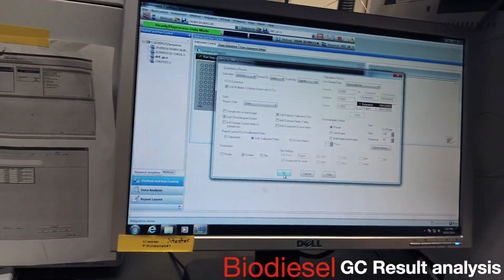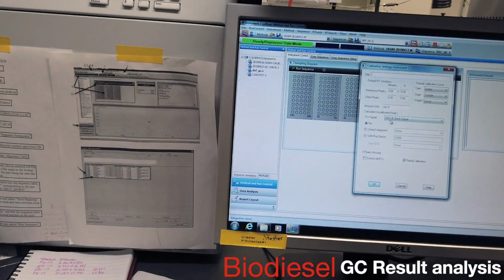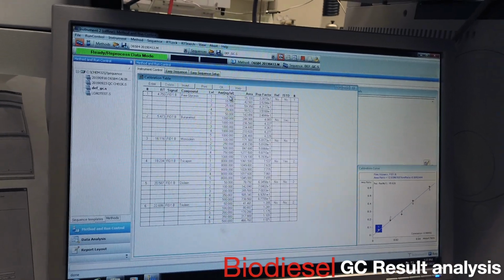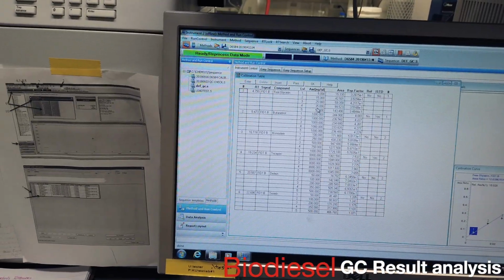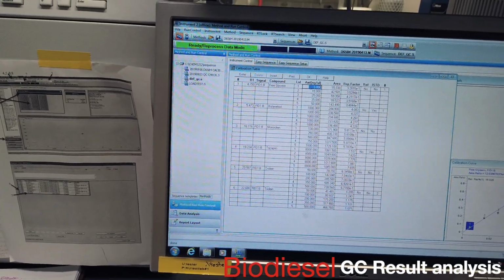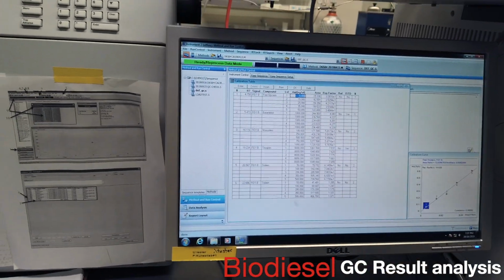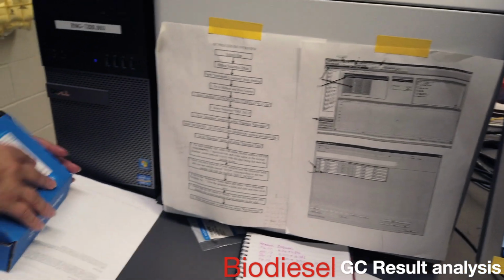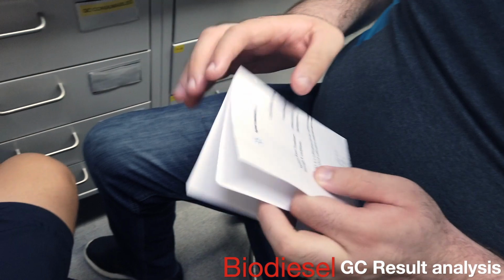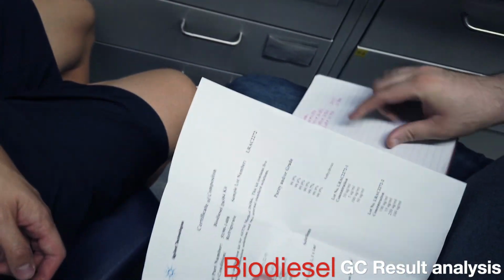So what do you do now? Adjusting what you put in? I'm looking for, there. So one option is changing these, because I put these in at face value, whatever was in here. So we want this to come out as ppm.